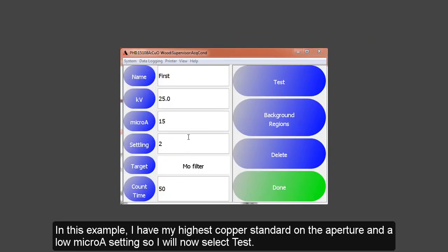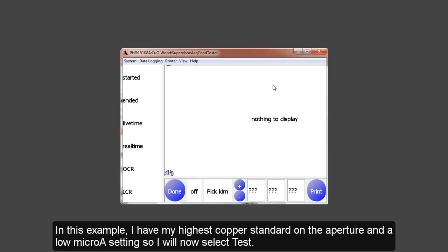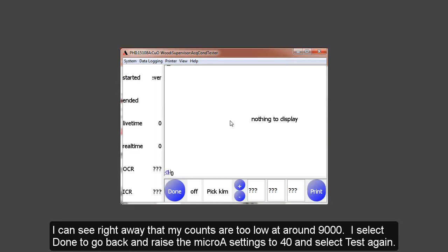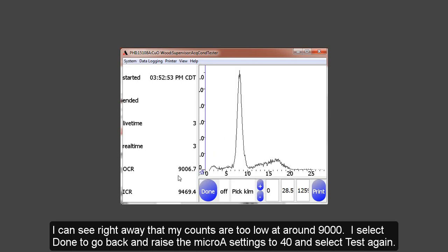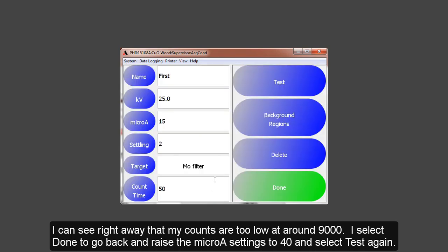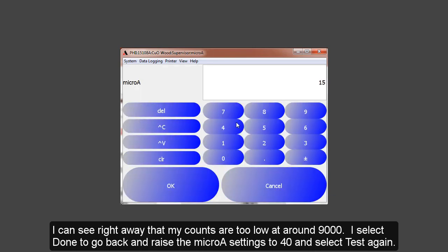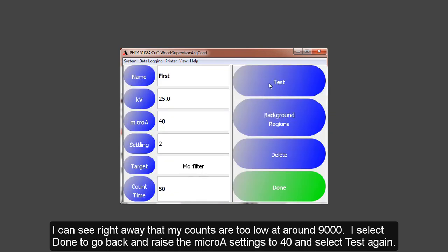In this example, I have my highest concentration copper standard on the aperture. I have a low microamp setting of 15 microamps, and I'll select Test. The shutter will open and the analysis will begin. I can see right away I do not have enough counts with only 9,000 counts. So instead of letting the analysis complete, I'll select Done. Now I need more counts, so I'll raise the microamp settings. We will try 40, and then we'll test again.